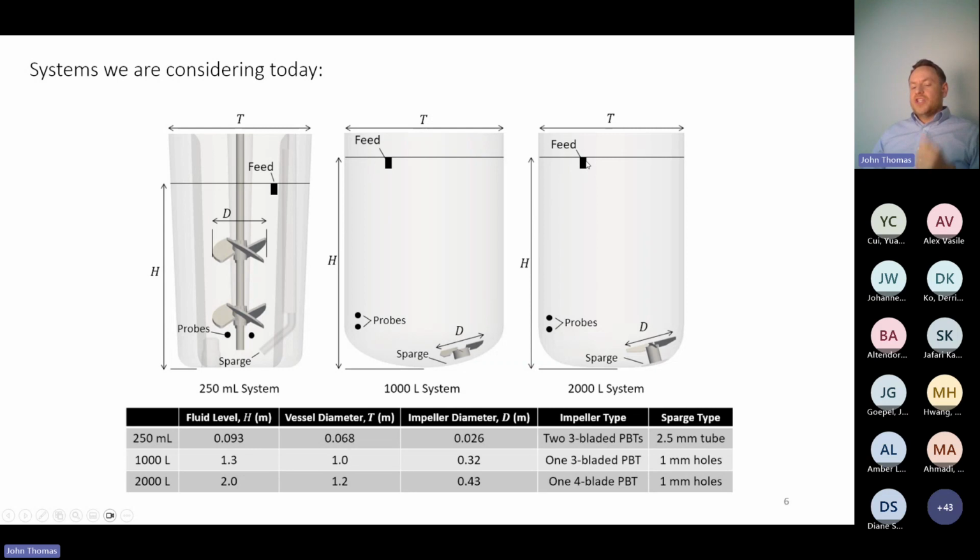We're going to talk about inline feeding control. This isn't necessarily just bolus addition, that is, the addition of nutrients to the top. We're going to talk about inline feeding of the system due to some sort of inline measured response. A lot of our M-Star users have inline, say, glucose measurement, which allows them to dynamically control the feeding rate in a way to realize the target glucose concentration over time. Others do bolus addition. It doesn't matter, but we will consider both.